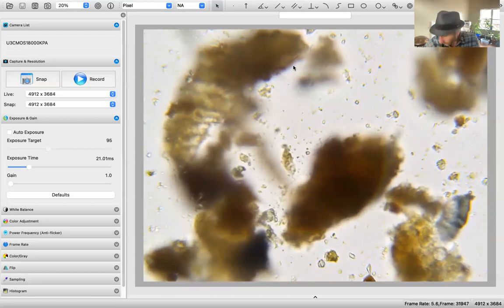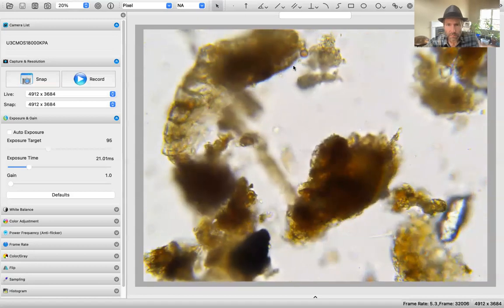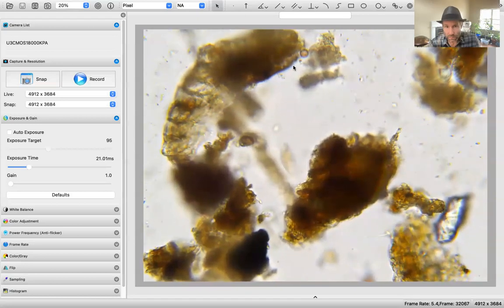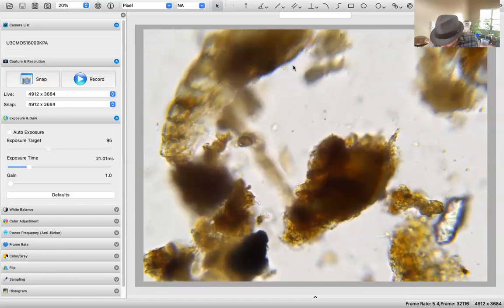Not sure why, there's a lot of liquid rushing out. There's a lot of movement and a lot of disturbance in the liquid itself. I might better hurry up in case we go dry. There's a lot of movement now. It must be going dry on the corners. Okay, I'm going to go, and oh, it might be a rotifer. That's probably what that is, I wonder. Interesting. Okay, so moving on here.